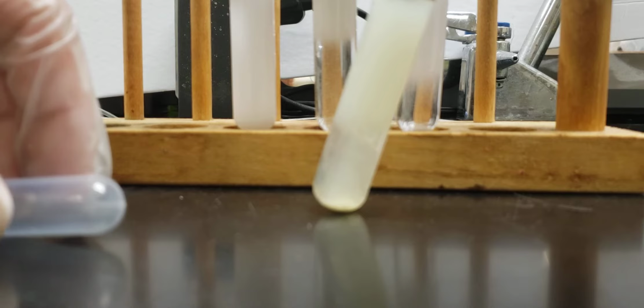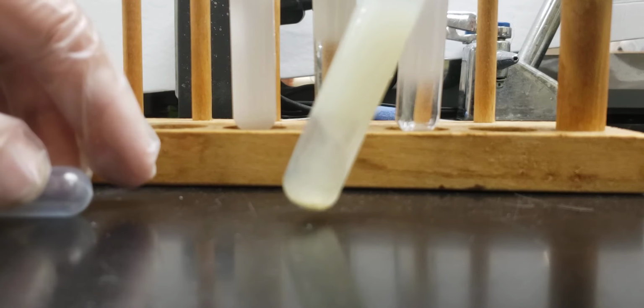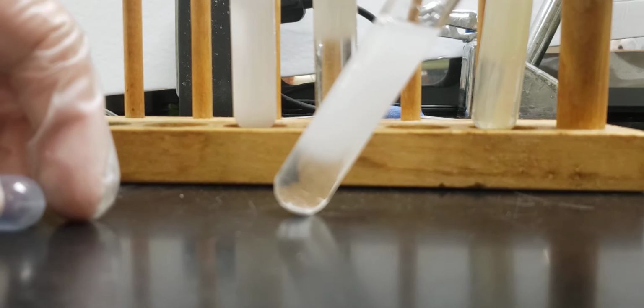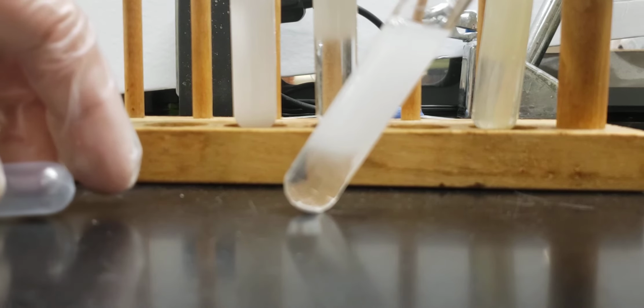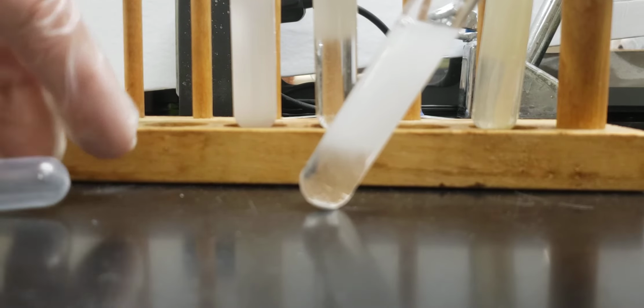This first solution, it doesn't seem to be getting much lighter, and in fact we could still see that there's a gradual amount of precipitate forming still. The second one, when we shake it up, we see that there has been a gradual change, that we have less dissolving in it than before. Okay.